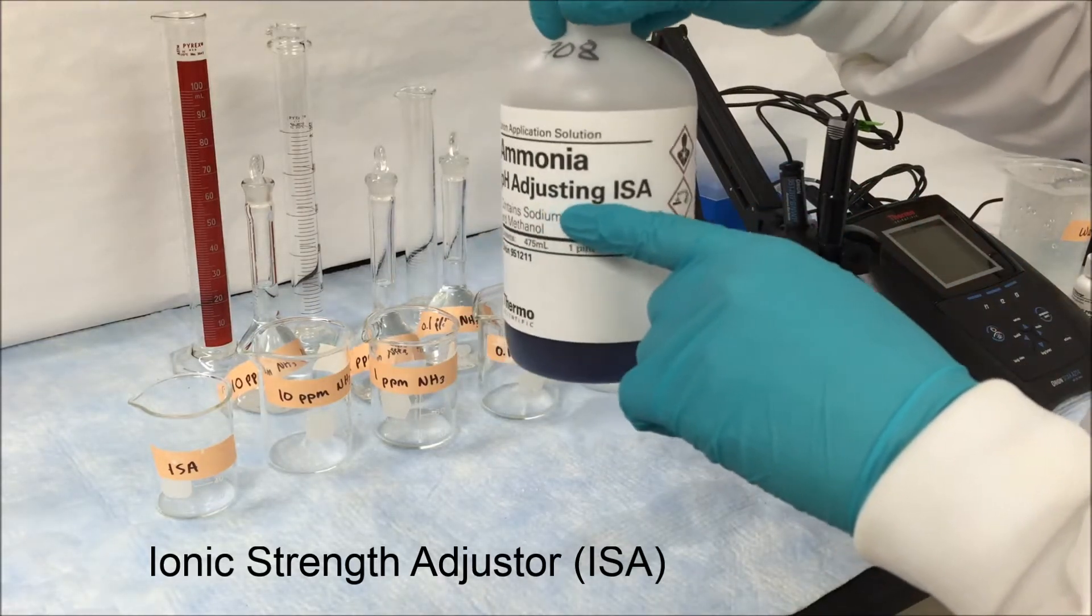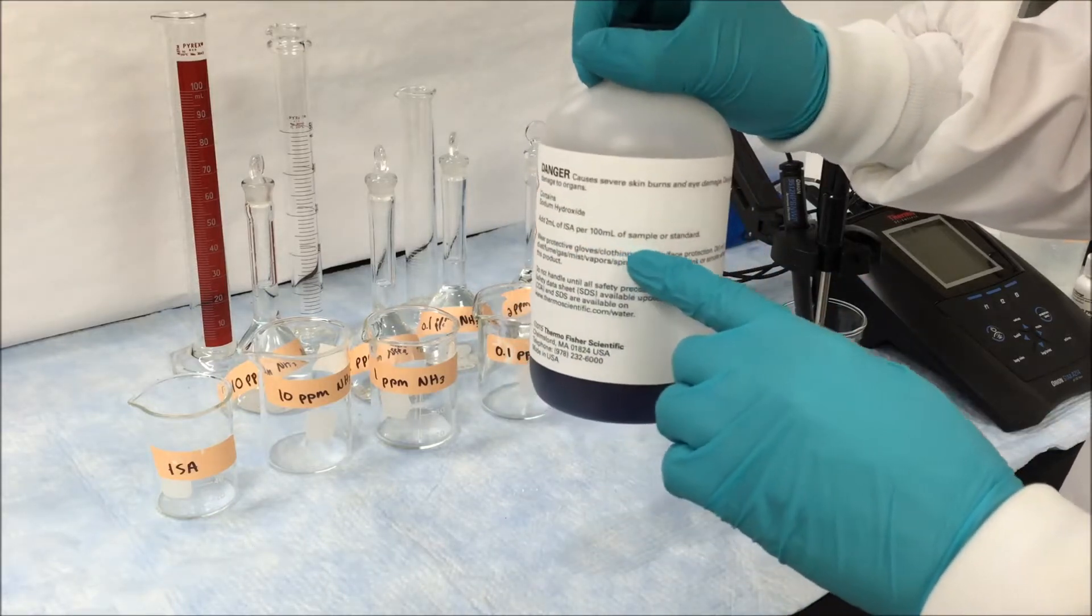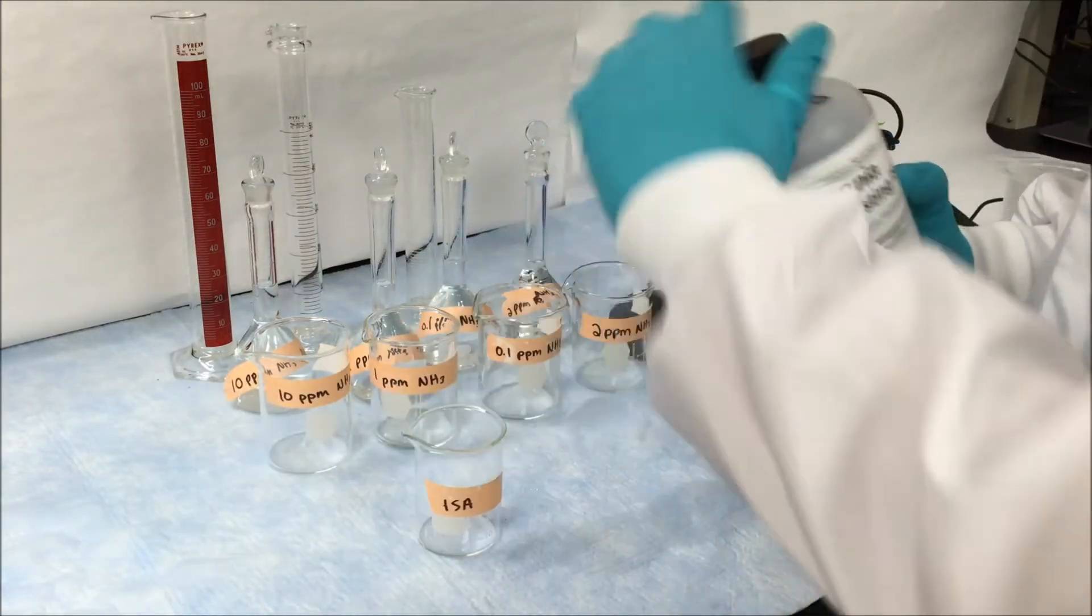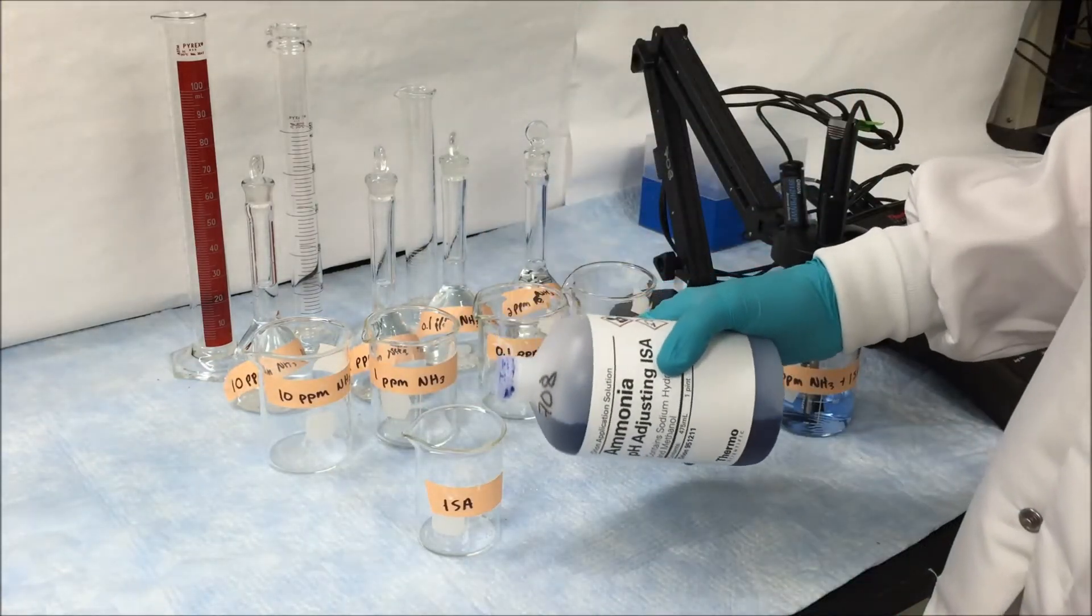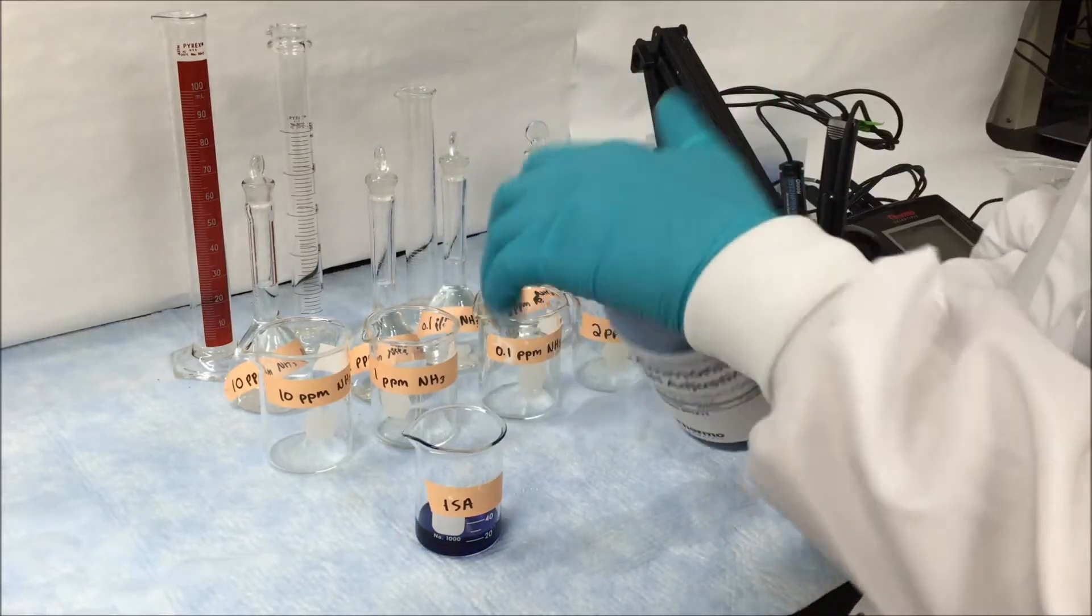First we start by preparing our calibration standards by adding our ionic strength adjuster or ISA. This ISA uses 2 ml of ISA per 100 milliliters of sample. We always pour out a small aliquot of ISA into a separate beaker so that we don't contaminate our stock solution.